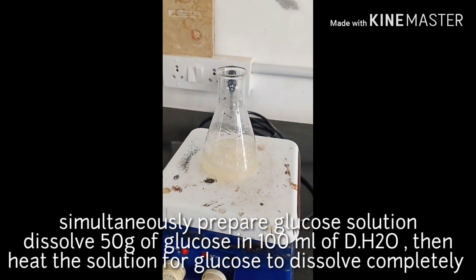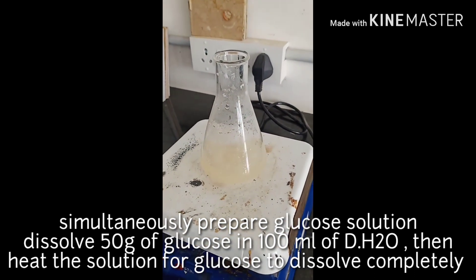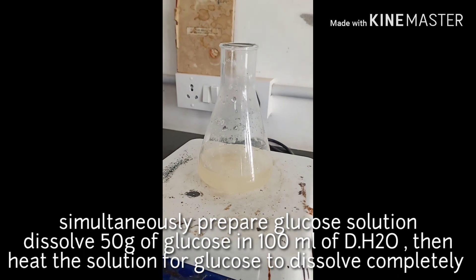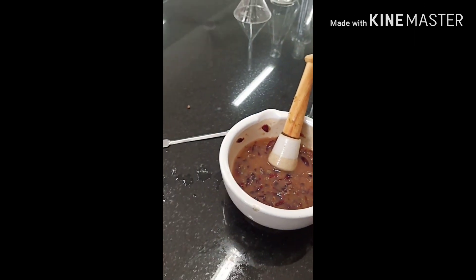We need a sugar solution for the wine preparation. We dissolve 50 grams of glucose in 100 ml of distilled water. Since the sugar solution does not dissolve completely, we heat it until it forms a syrup.